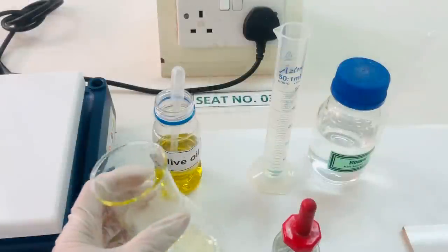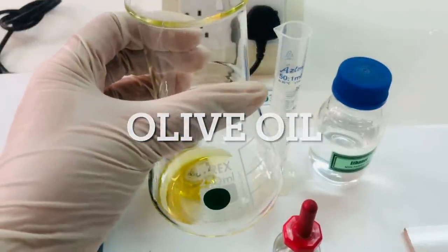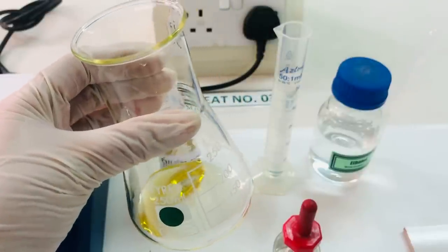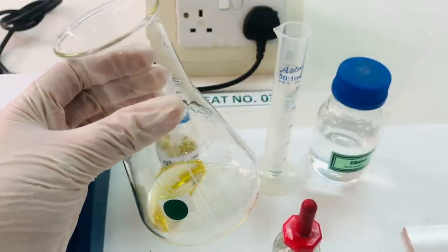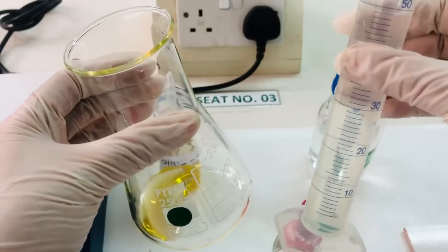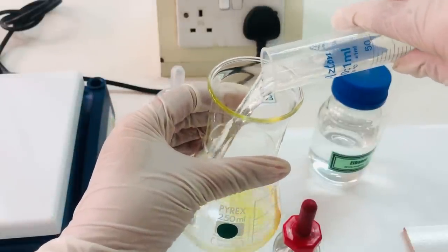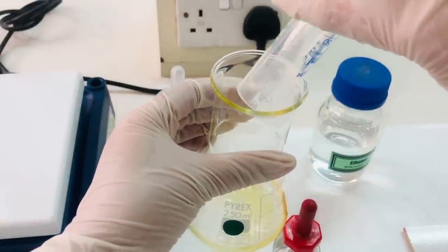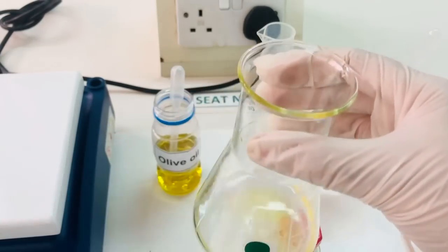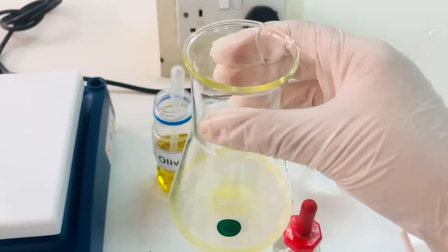The next sample that we are going to use is that of the olive oil. We have weighed 5 grams of olive oil in this conical flask. To this we are going to add 50 ml of the neutralized solvent, which is ethanol. After adding 50 ml of solvent, we are going to place this conical flask on the hot plate.